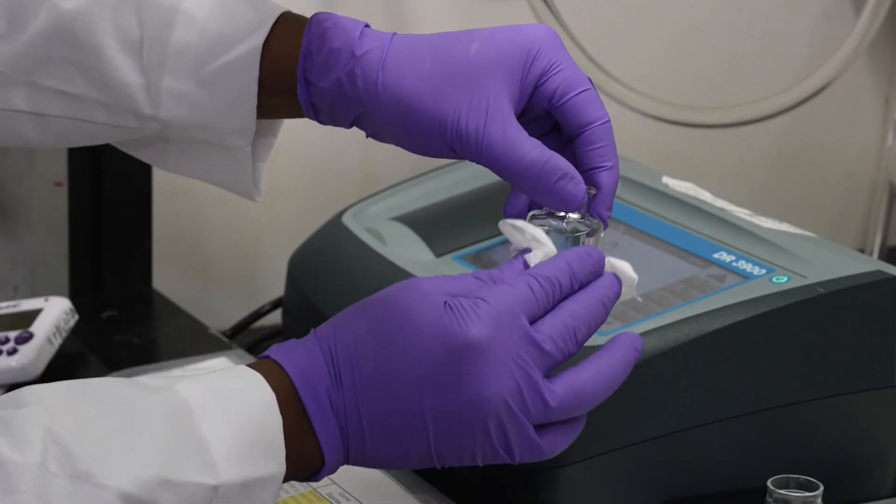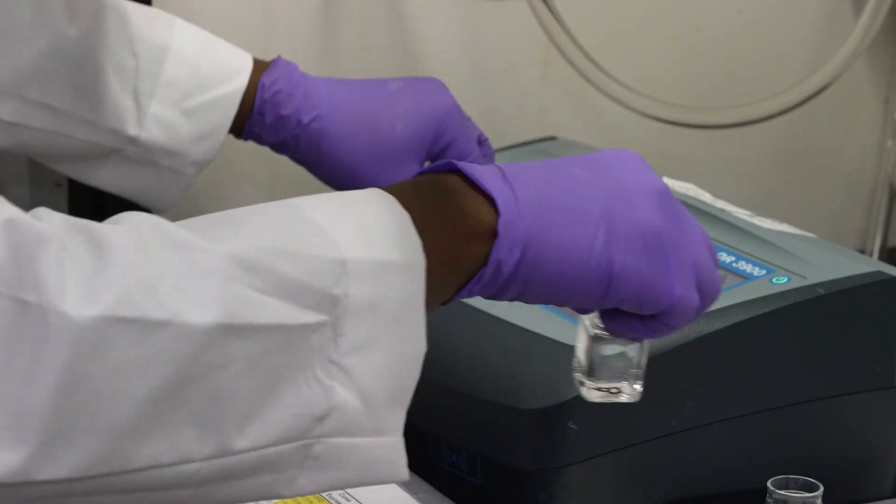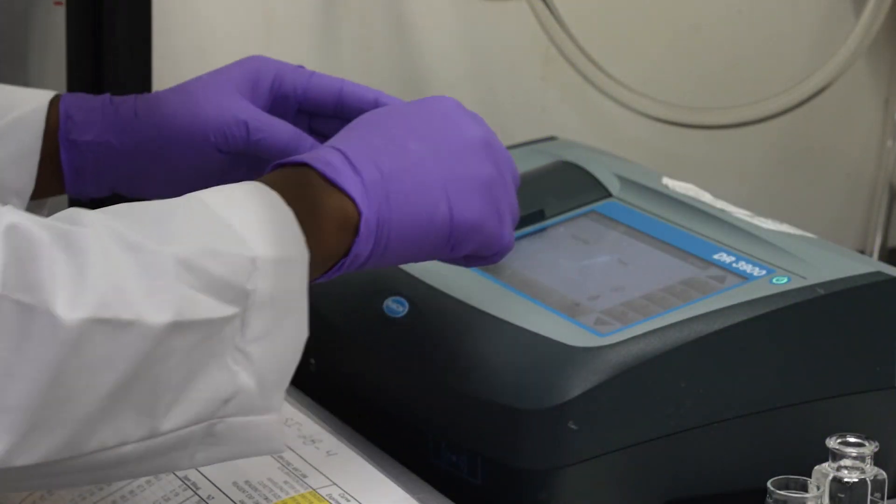We also provide APL and QPL product cleanliness testing and unknown material identification. Code 134.5 tests thousands of water samples each year, most commonly for grade A analysis, which typically includes conductivity, chloride, pH, and silica.